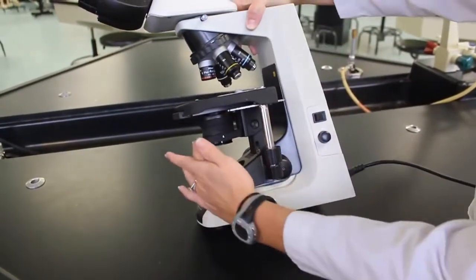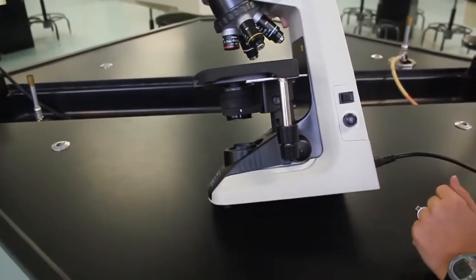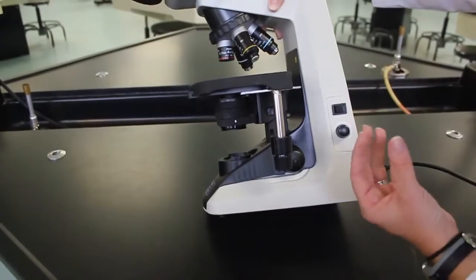Underneath the stage, this is the condenser. It controls the amount of light that comes in and narrows the light beam.